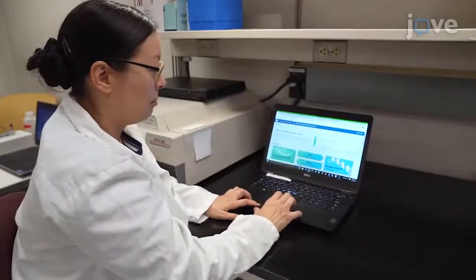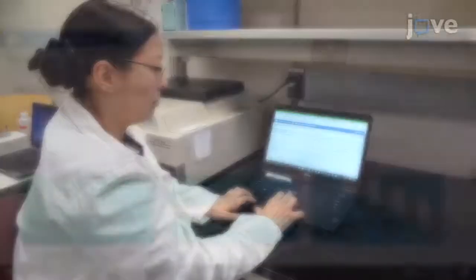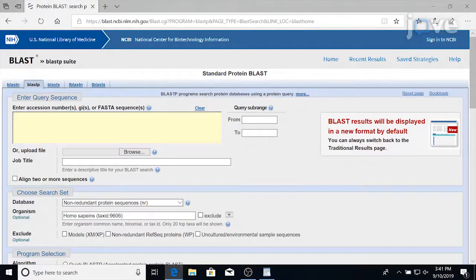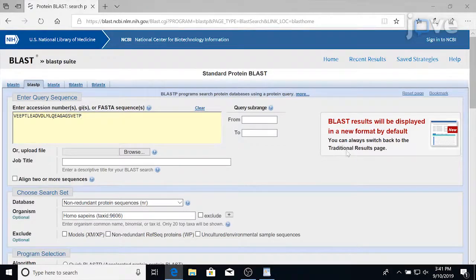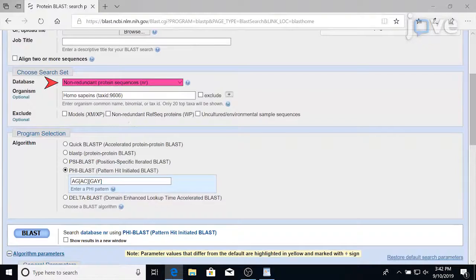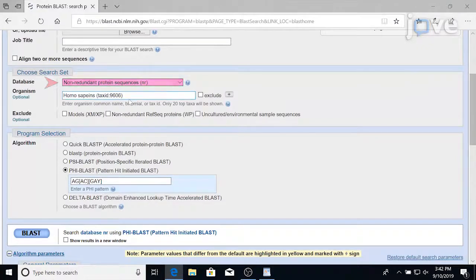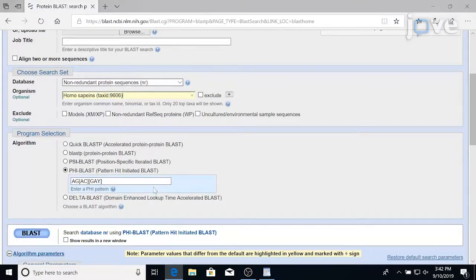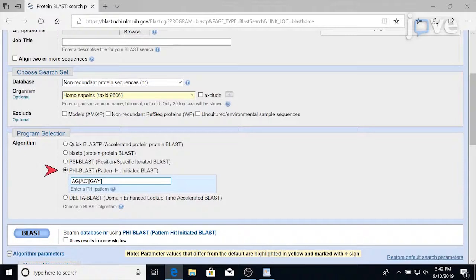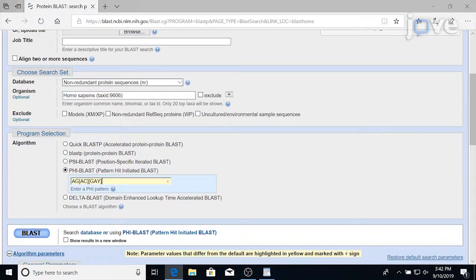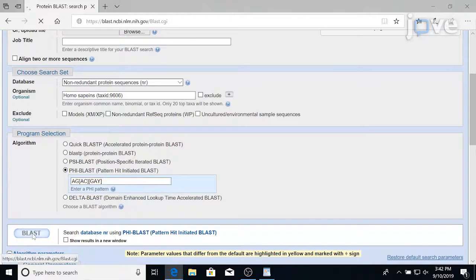Start by opening Protein Blast. Input the 20 amino acids surrounding the scissile bond in the viral polyprotein and select non-redundant protein sequences. Then type in the host genome to be searched. If needed, select Phi Blast and type in a pattern sequence where square brackets indicate that either amino acid within the brackets can be at the substitute position. Then hit Blast.